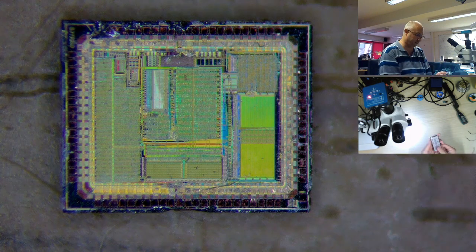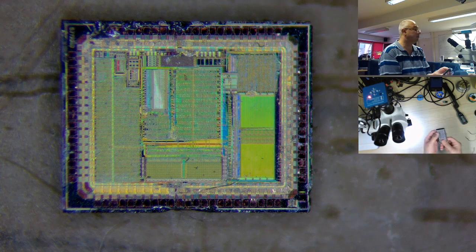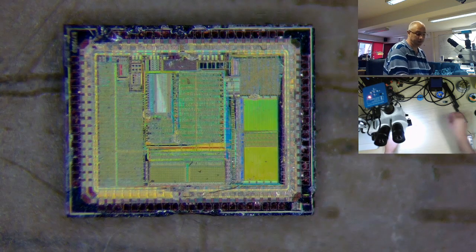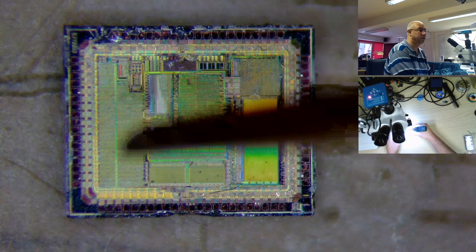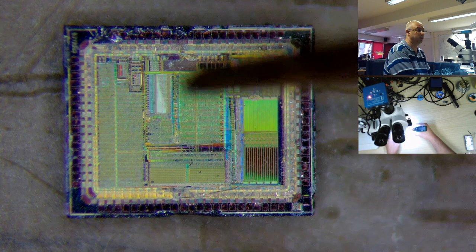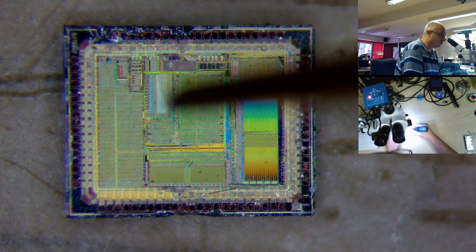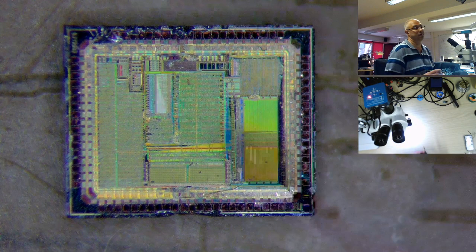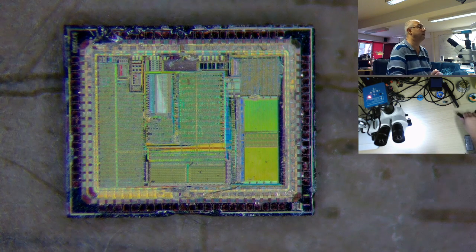I just don't see the point of this remote. It should maybe be put into a mouse or something, or more cleverly — when you press power it should just keep the infrared going. Anyway, to reverse engineer this chip with this camera is a nightmare. If I try to put my tweezers in there and move them, by the time the image updates it's just nowhere near where I actually want to place them — I have to look into the eyepiece instead. It's just about the camera really, so unfortunately I'm just returning this — I bought it on Amazon.